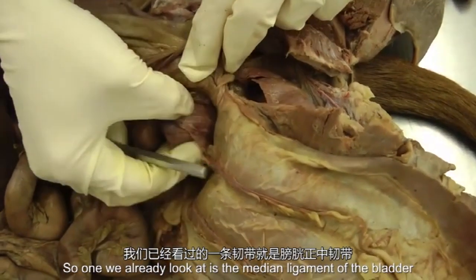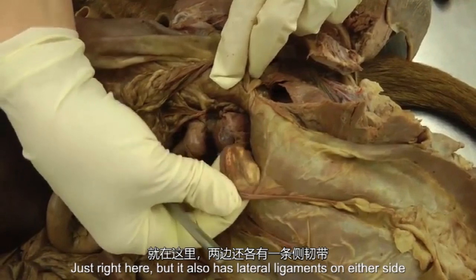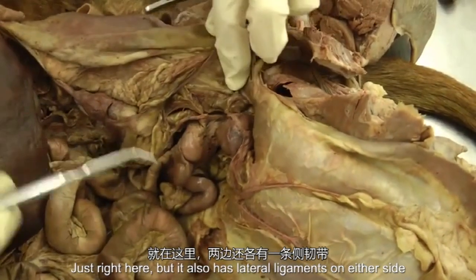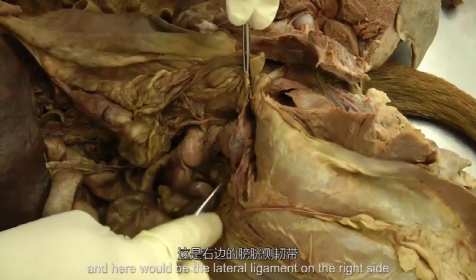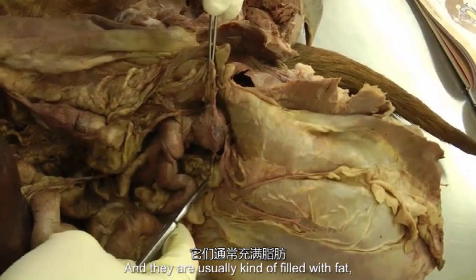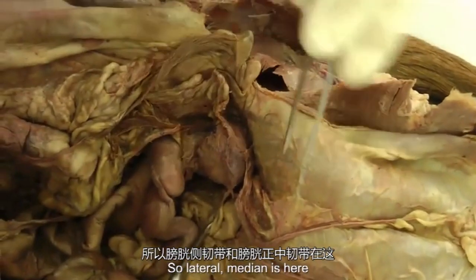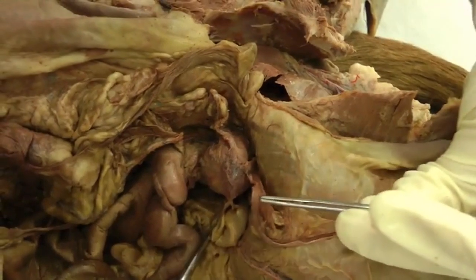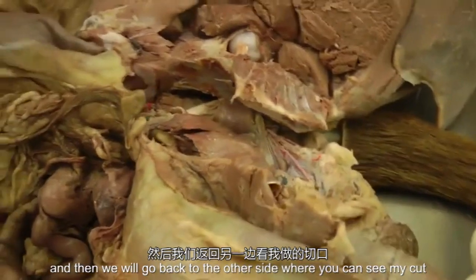So one we already looked at was the median ligament of the bladder, which is right here. But it also has lateral ligaments on either side. So here would be a lateral ligament on this side, and here would be a lateral ligament on the right side. They're usually filled with fat, but those are the lateral ligaments of the bladder. So lateral, median is here, and then we'll go back to the other side where you can see my cut.